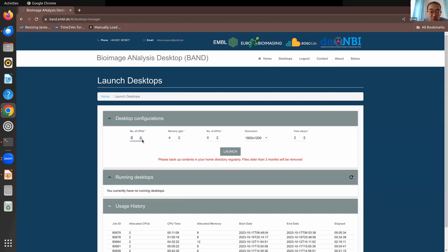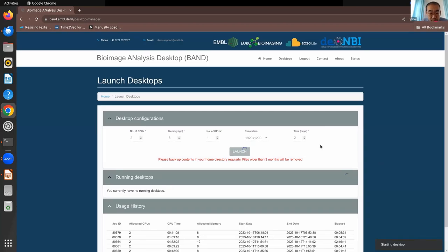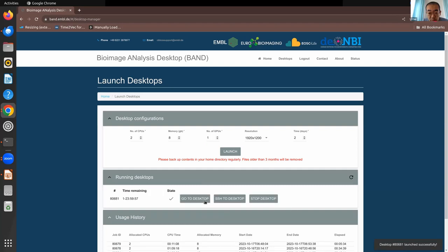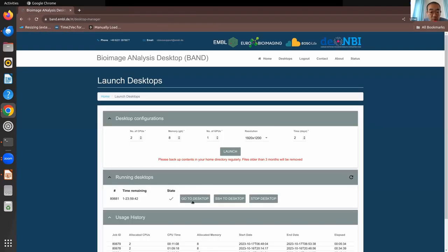You can choose the number of CPUs, memory, and whether you need a GPU. Currently we'll allocate one GPU to one desktop and click launch. You can see your desktop is already here. There are two ways to access it: SSH to the desktop, giving you a terminal in your browser for command-line work, or click 'Go to Desktop' for the graphical desktop.